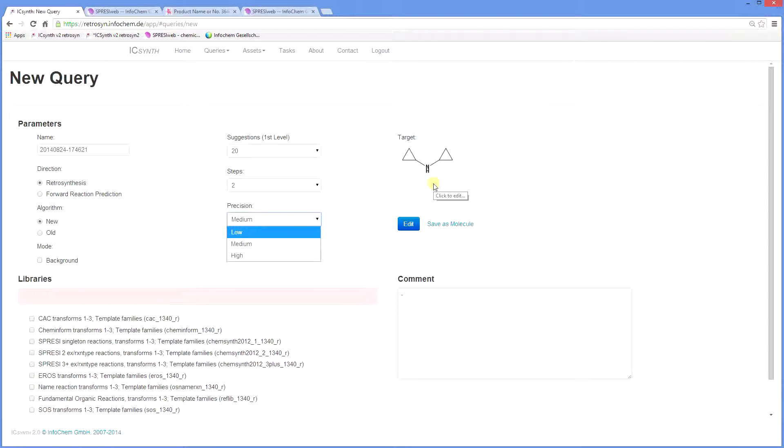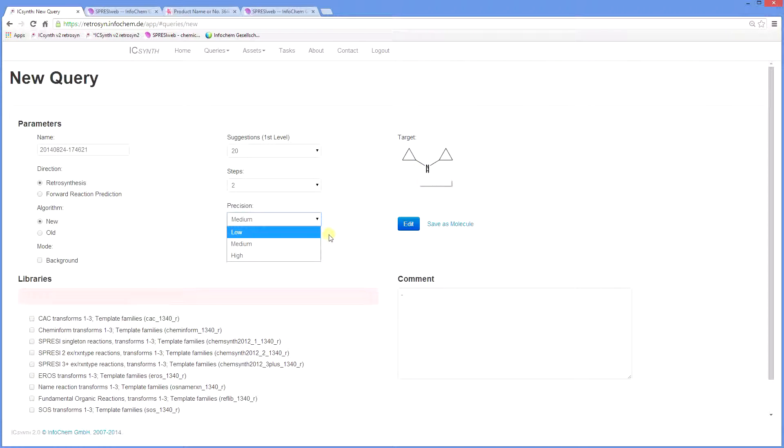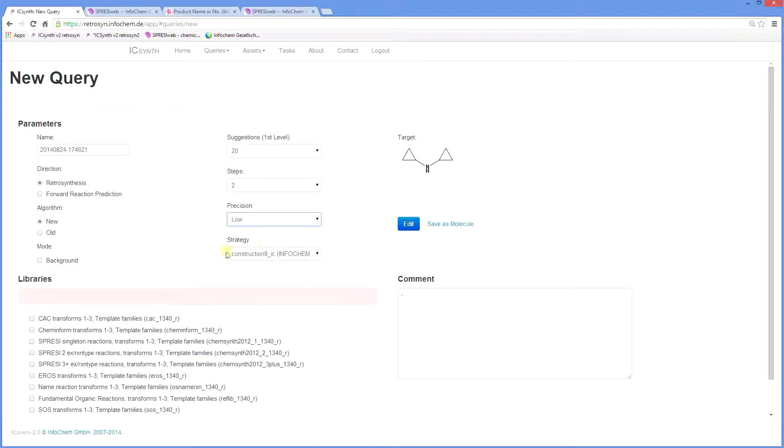Conversely, low precision matches smaller templates with the target, so it gives more answers and possibly more noise. We will set this for low for this particular query. The default strategy is given here and we would recommend that you would use the default strategy.